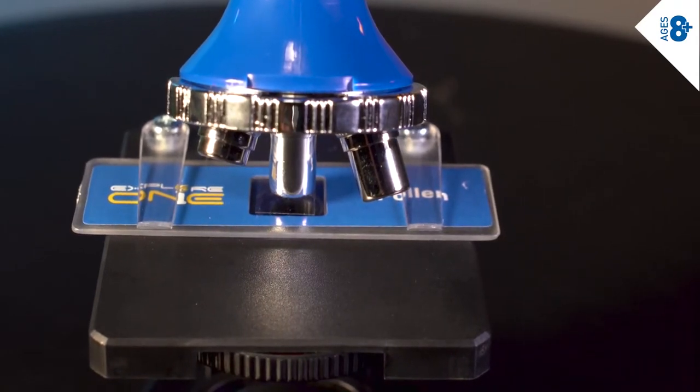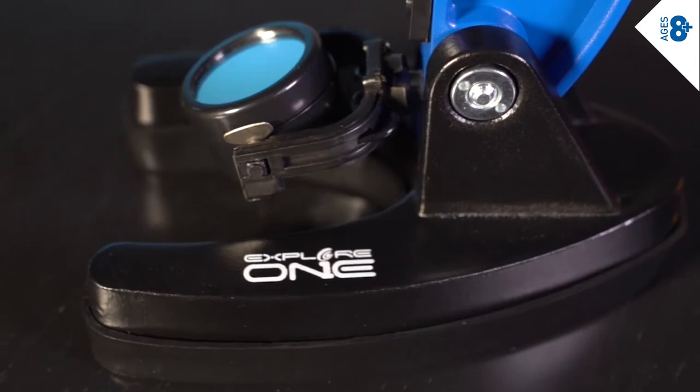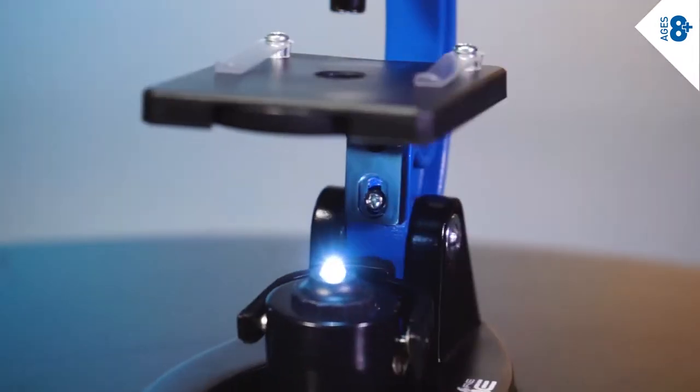The reversible illuminator unit combines a flat mirror for using ambient light and a white LED for illumination where you need it.